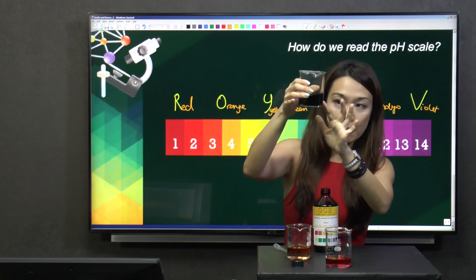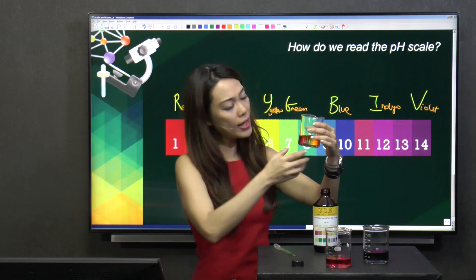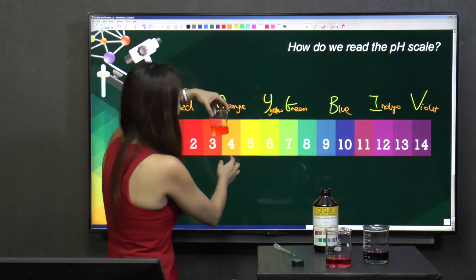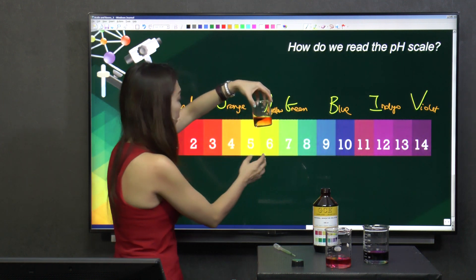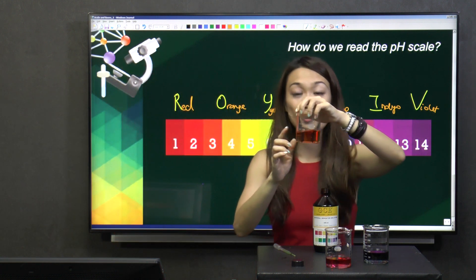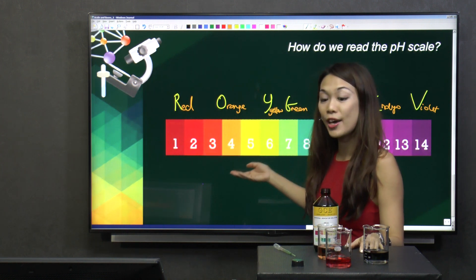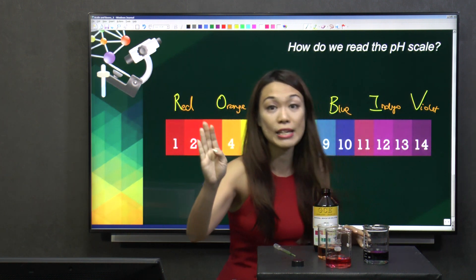I hope this is captured well and you don't see it as black. Then, I have another one that is a little bit orange, and a little bit yellow, and a little bit orangey red. Okay. Now, what is this solution? Obviously, it's around this range, also slightly acidic. Thank God I didn't drink any one of them.